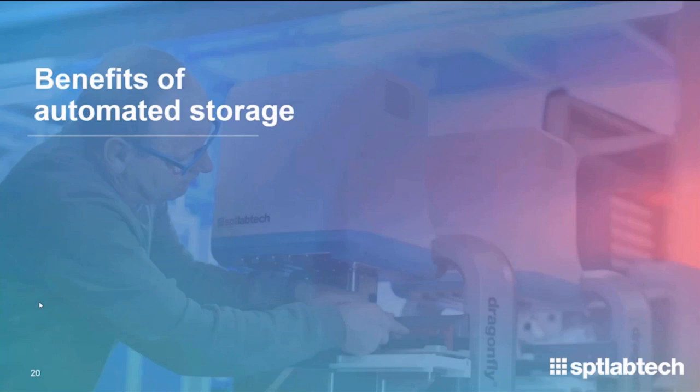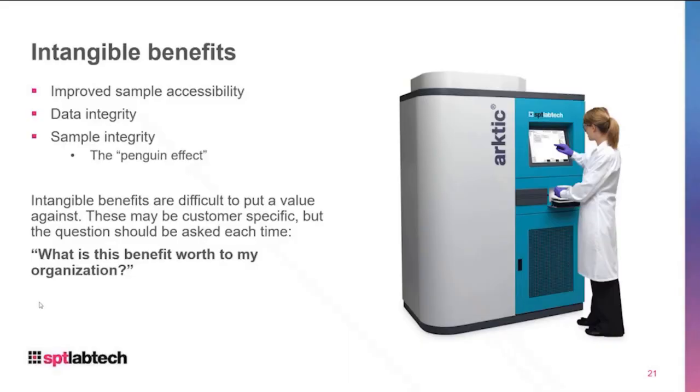The benefits of automated sample storage, I think we've talked a little bit about different ways to think about it. Really, this is a nice setup into the business justification bit of this process. You can come at it from a few angles, but one way to think about it is the intangible benefits and the tangible benefits.